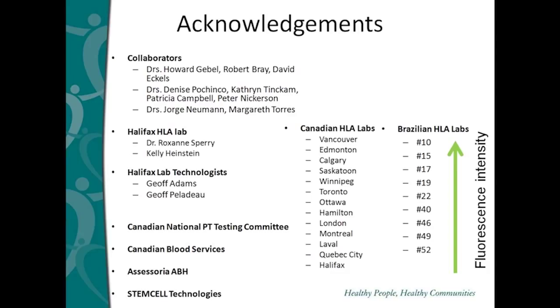We would run between 5 and 7 renal transplant candidates, 2 as the primary ones and 3 or 4 others as backups. We would typically test at least 2 to 3, or sometimes 4, sera on each patient in duplicate. We would also run a liver transplant candidate, maybe 1 to 2 cardiac transplant candidates. Again, we would choose multiple sera on these patients, and that's all doable in a very reasonable time frame.